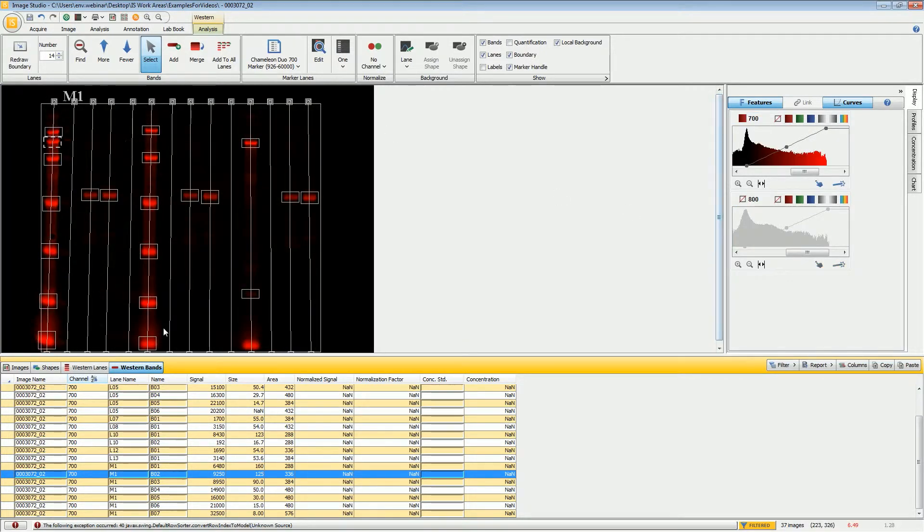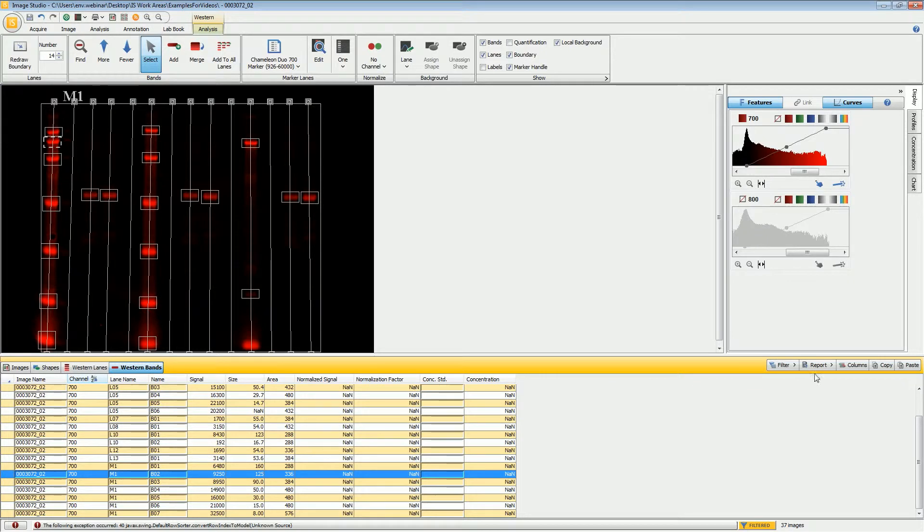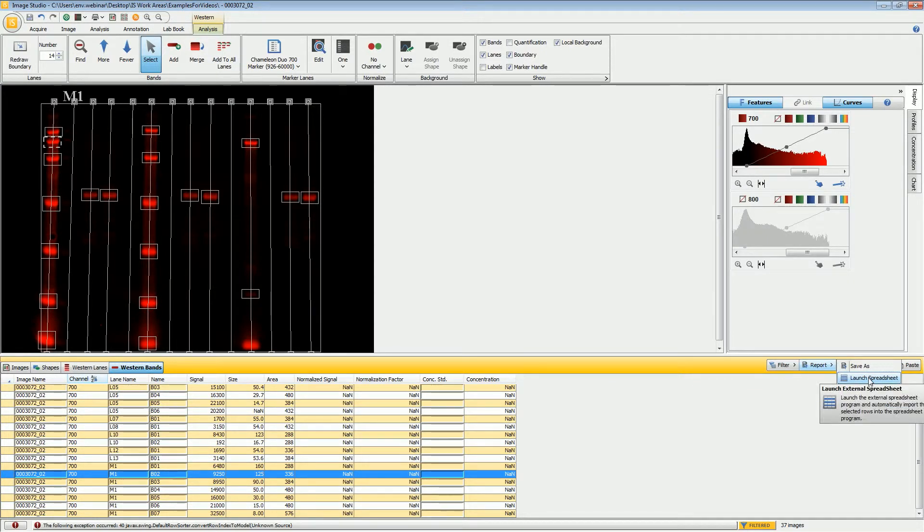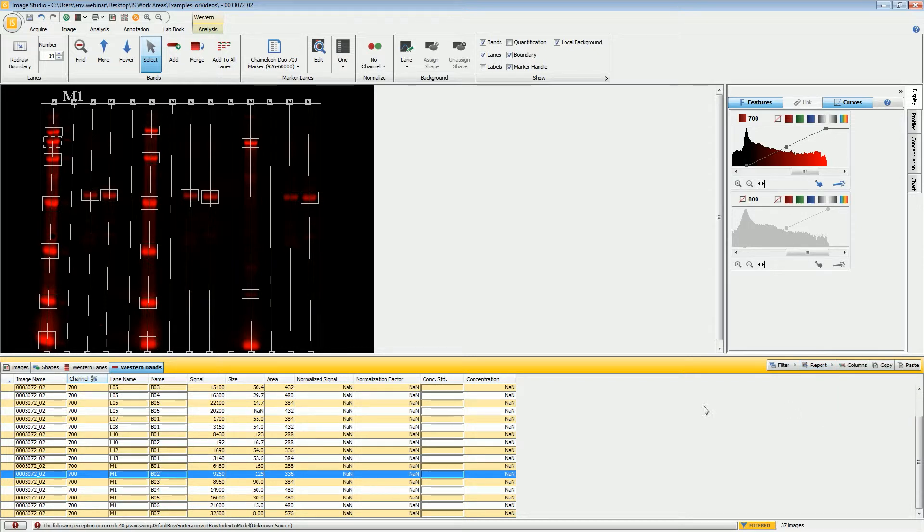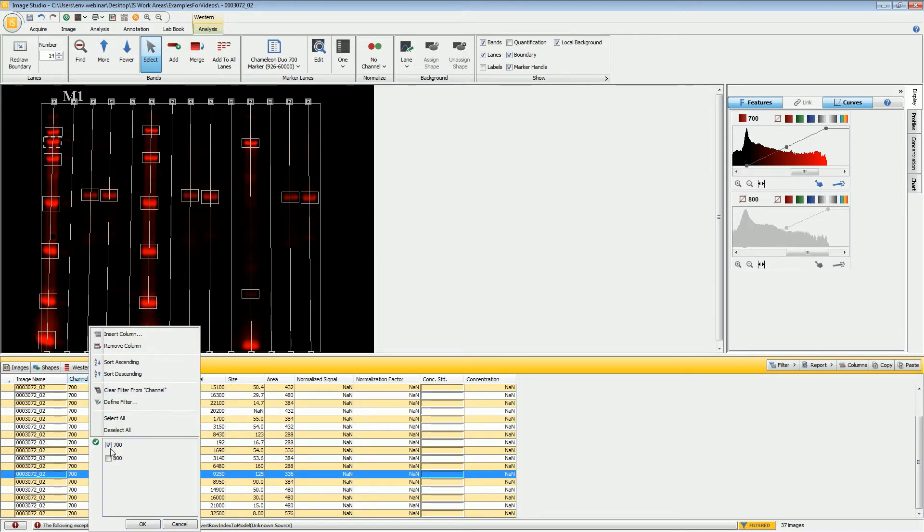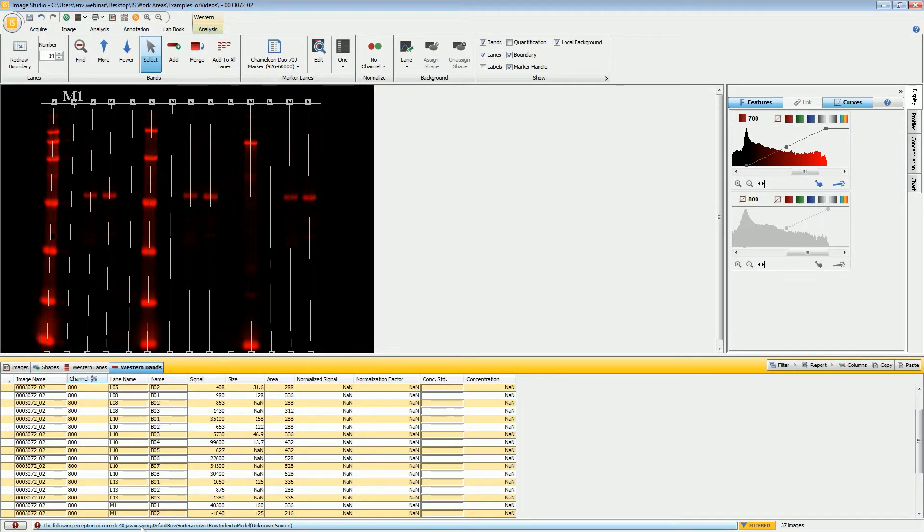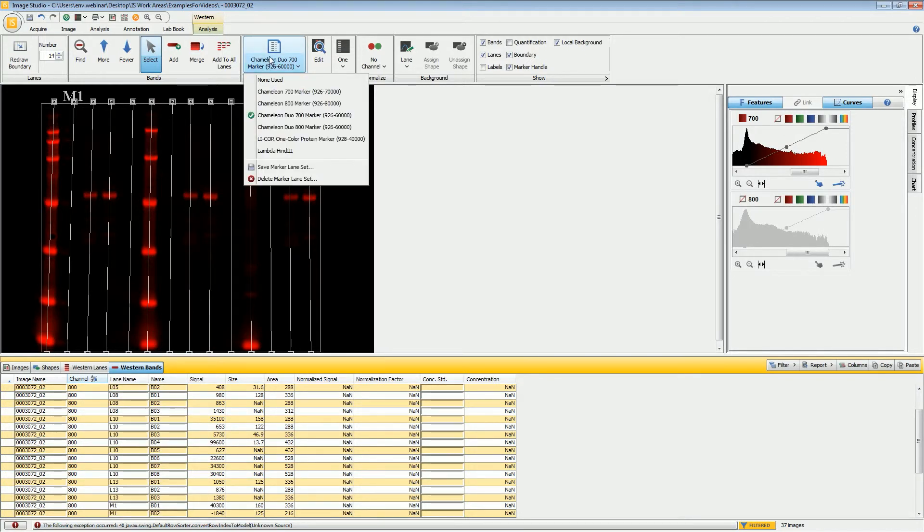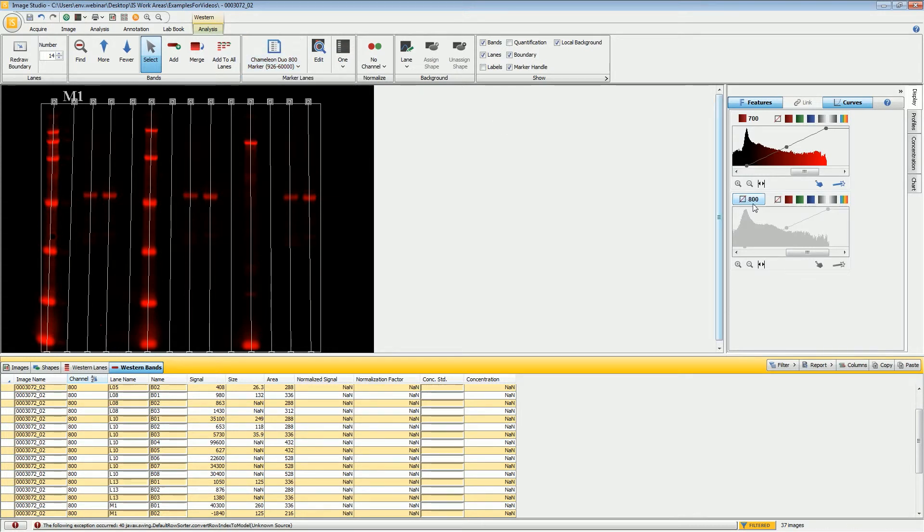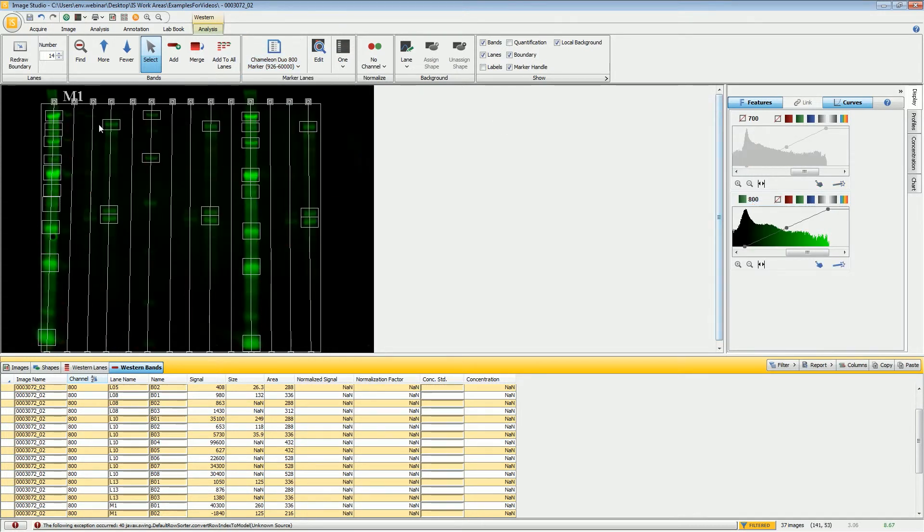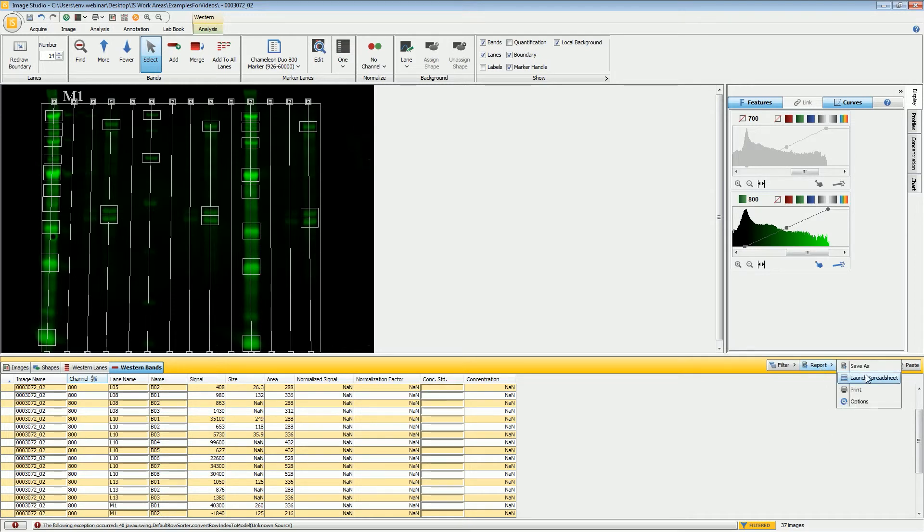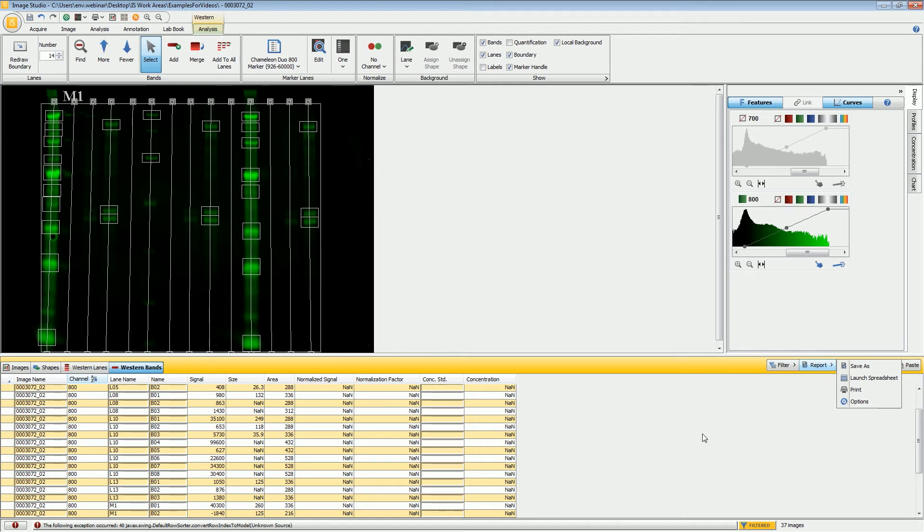Once I have everything shown correctly and I've made sure that I'm using the correct marker and everything is done correctly, I will then go ahead and export as I normally would. If you want some more information on exporting tables, that will be covered in a different tutorial video. Once you have exported all of that, you will need to switch back to the 800 channel and then switch your marker to the 800 marker. Make sure all the bands are set up correctly, just like we did with the 700 marker. Then you go ahead and export the 800 data on their own, and then everything will be sized correctly. Thank you very much.